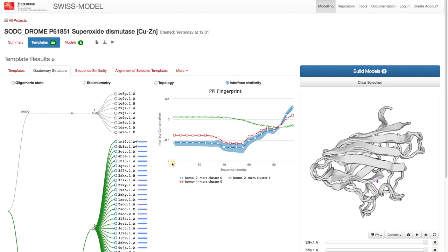We can see here that the top dimer cluster seems to have the most conserved interface and thus most likely represents the correct oligomeric state of our protein.